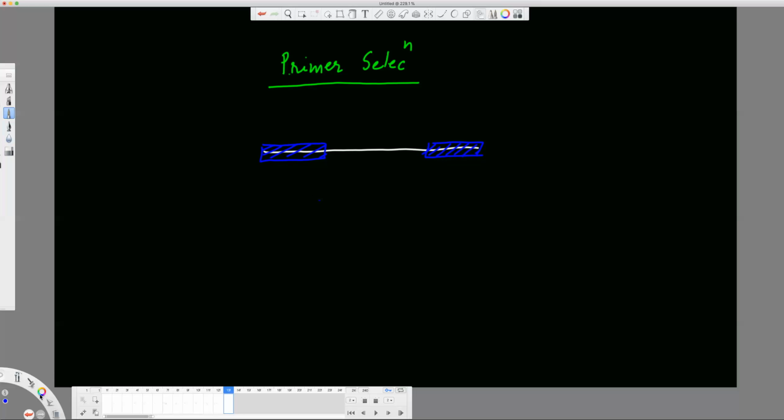So now the objective is, and the length of the primers are generally 20 base pair, 18 to 22 base pair. That's the appropriate length of a primer. So you can have this as one primer and this as another primer, some sequence complementary to this region of the sequence. Now there is no reason to choose this immediately without testing whether this is appropriate or not. This might be appropriate, might not be.